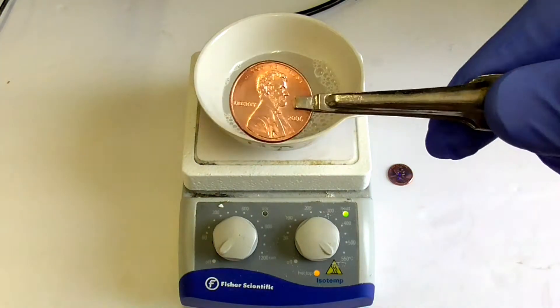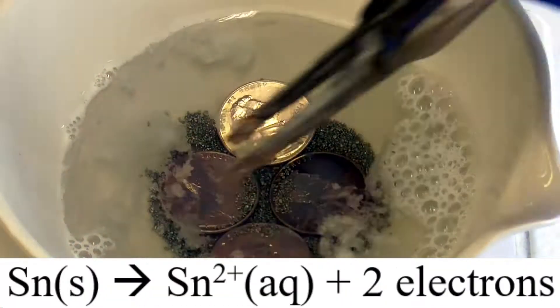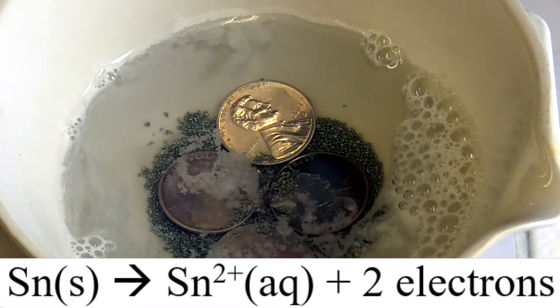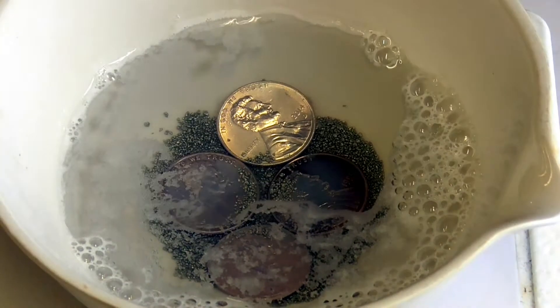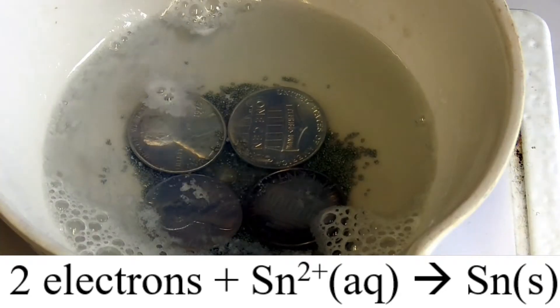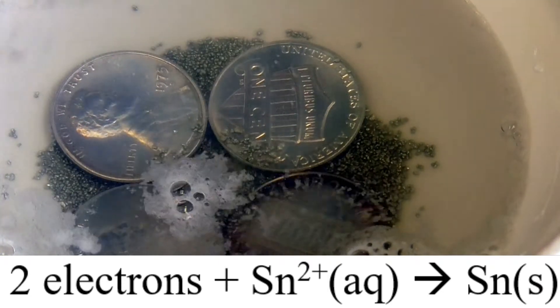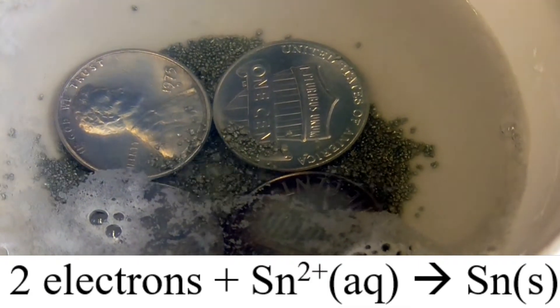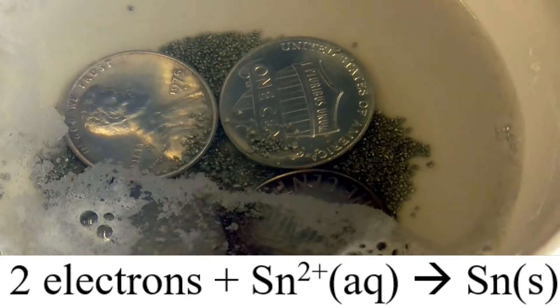It's actually an interesting chemical reaction that goes on. The tin atoms in the grains of tin lose two electrons, and this forms tin ions that dissolve into the mixture. The two electrons go into the surface of the penny, and the dissolved tin ions then gain these two electrons on the surface of the penny, and they plate out as tin metal. The reaction happens because the tin atoms bind more strongly to the copper atoms in the penny than they do to each other in the grains of tin.